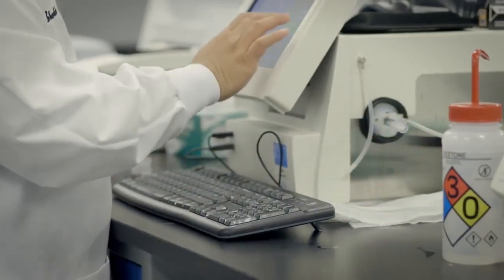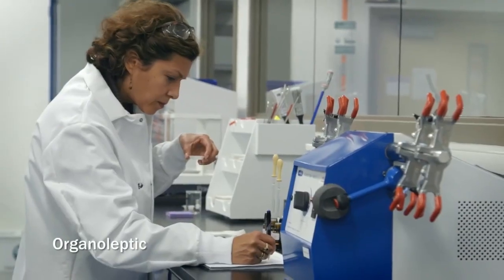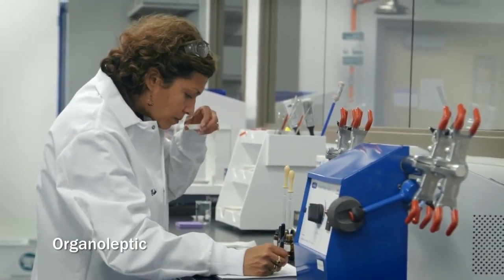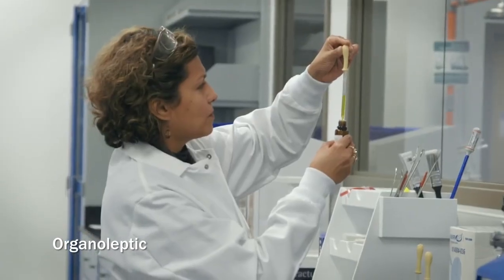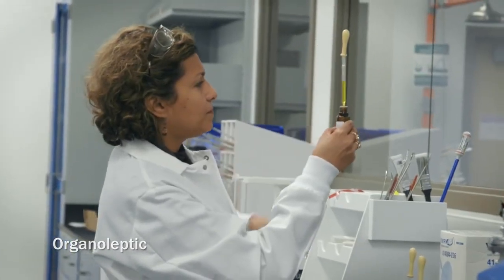The other piece to the physical testing that we do is the organoleptics. Each oil is unique and has a specific appearance, aroma, and color, and we document those at every receipt of all the samples that we receive. That is part of our release criteria for each oil.